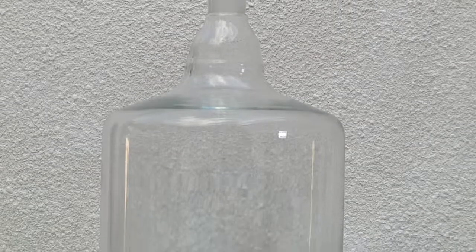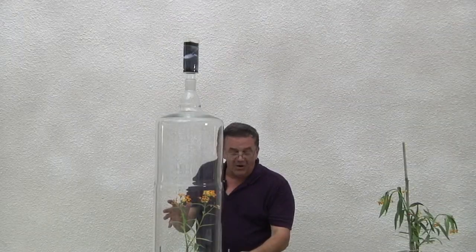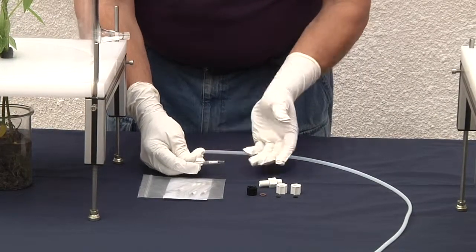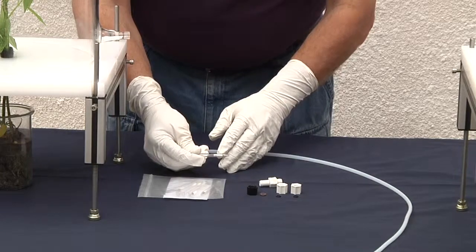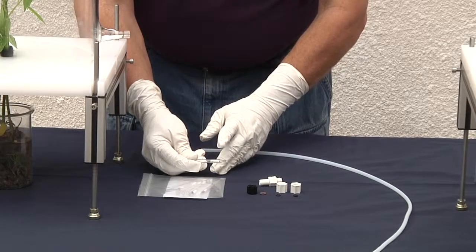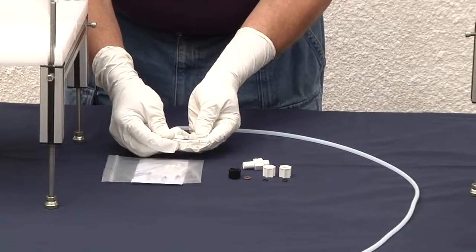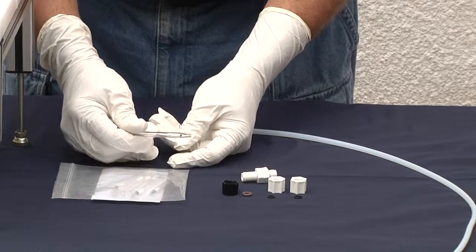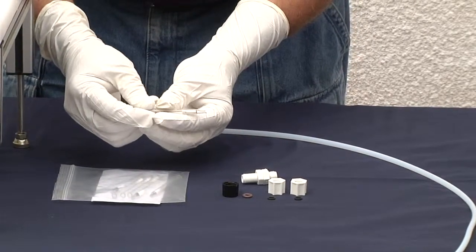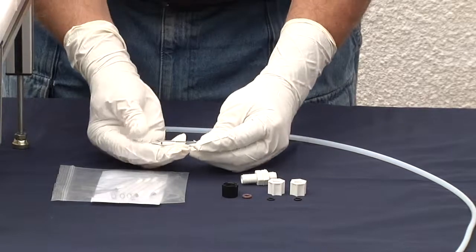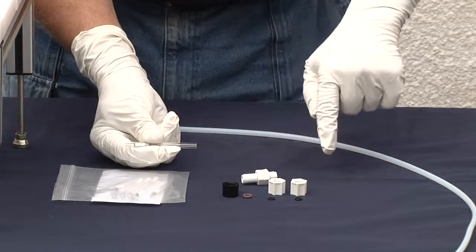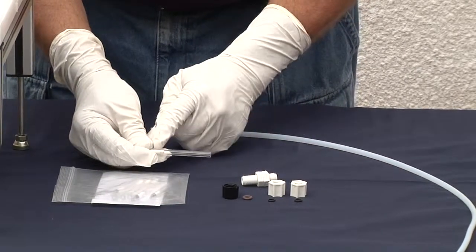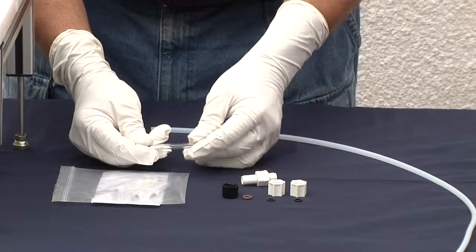At this point we're ready to attach our volatile collection trap. Our volatile collection trap or VCT is designed where we have a stainless steel screen that is fused into the glass, then our absorbent, some glass wool packing, and then a retaining ring. The normal way for installing the VCT was for the tip to go into our chamber and the air to flow through the tube. Sometimes we've had problems if pressure builds up too high that our retaining ring comes loose and we lose our absorbent.